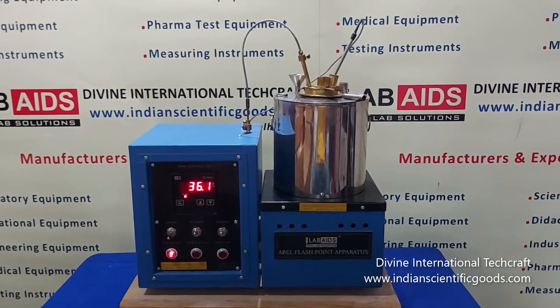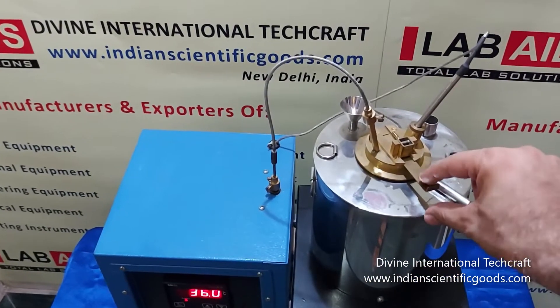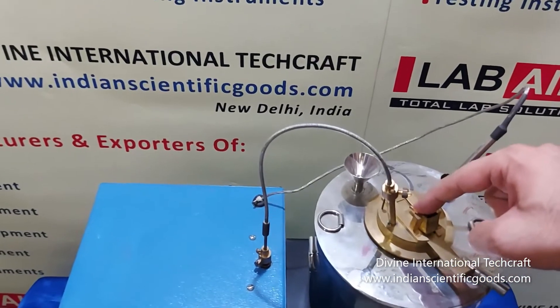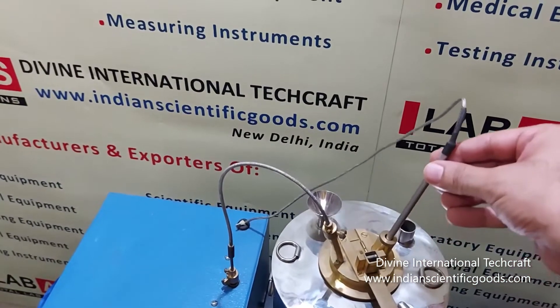and below 70 degrees centigrade. The apparatus consists of a brass cup with a machined cup cover that has a shutter mechanism, a test flame arrangement, an electric stirrer, and a socket for a thermometer or a thermometer probe.